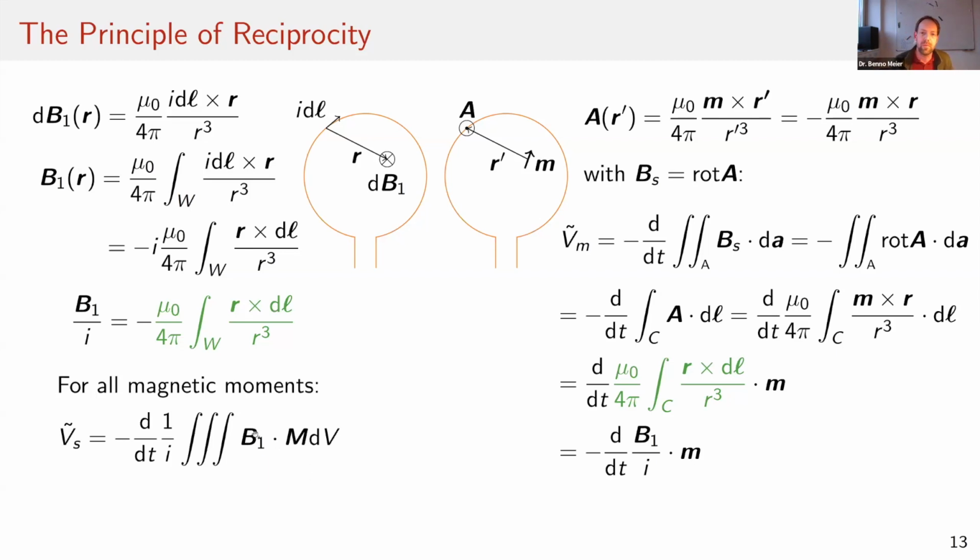And if now I assume that the magnetic field, the B1 field, is constant and the magnetization is also constant, and I furthermore assume that the B1 field is just confined to the coil, then I can replace this triple integral with B1 times m times the volume. Yeah, so this is what I have here, B1 times m times the volume. And the omega here I get because I still have to take the derivative. Okay, so this is now my induced voltage.